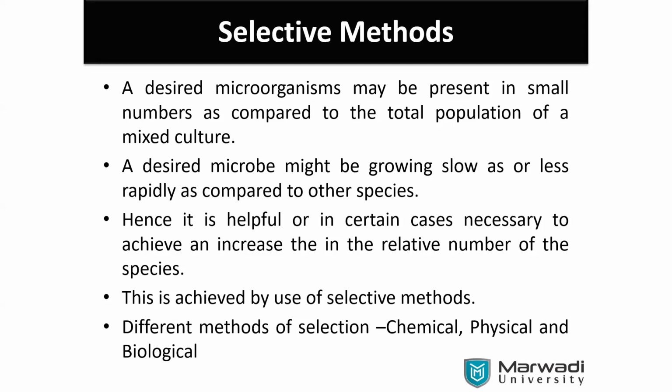Earlier we kept plates within one incubator. It had some raw materials. Fungal spores were there, they were looking to culture the fungal spores. So from the air, fungal spores may have been introduced and contaminated your plates. Whenever you keep plates for at least 1 week or 10 days, they should not get any contamination. Several plates don't have any such things. Like Rajesh, written as Rajesh, maybe he has done it properly. There is no contamination. Okay, it is a good sign.